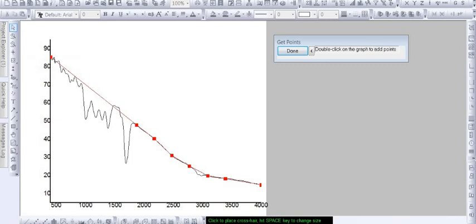In order to add a point, as already written here, just double click. As you can see, there are still some points we can add so that we get a proper baseline correction and the chances of error are very low. So I'll just double click on the line and add the points. It's up to you how many points you want to add.